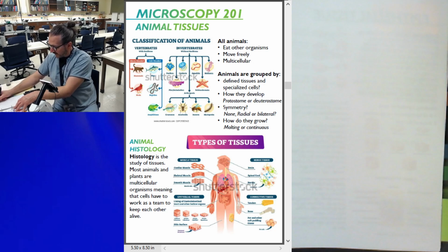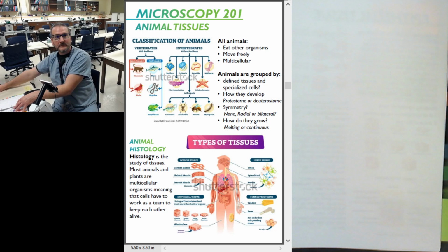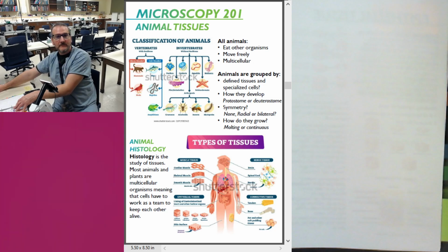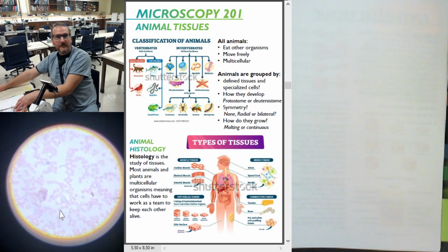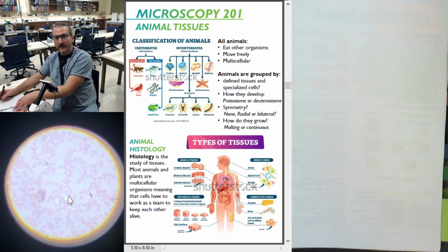Blood, it's a connective tissue. I lost my image, let's get it back. And I can see lots of these blood cells. Look at the little red blood cells. I'm not going to draw every one of these, that's crazy. But if I draw a couple of them, the red blood cells look like hollow. So I'm not coloring them in.